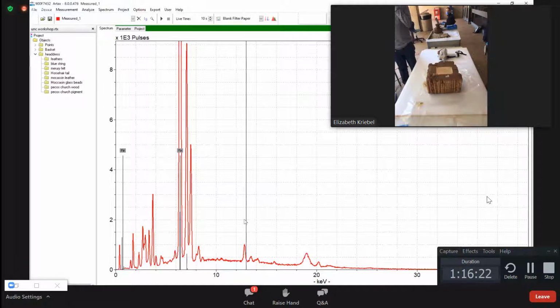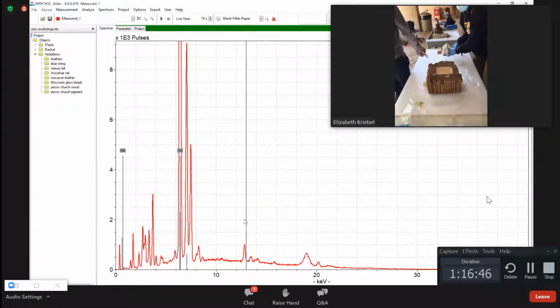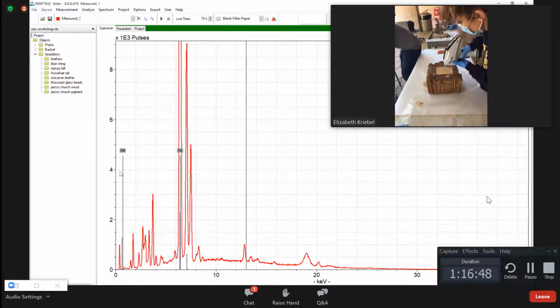This is the problem with these kinds of techniques. Do we want to know what the ink is? Do we need to know? I think the way to get a date on this piece of paper is just a quick 14C date on the paper itself, and that will tell you when they added the note. Okay. Well, I'm very curious about the ink, but if it's only a good thing to know, yeah, let's do it. It takes what, 10 seconds? Yeah, I know, it's just a slippery slope of these things.